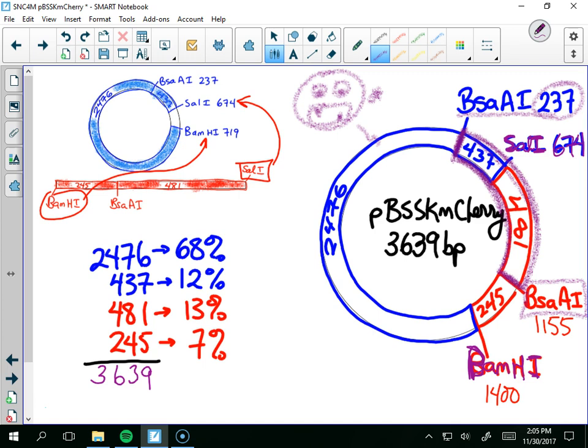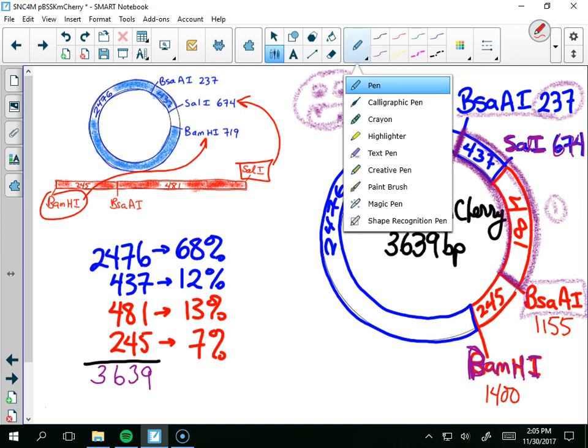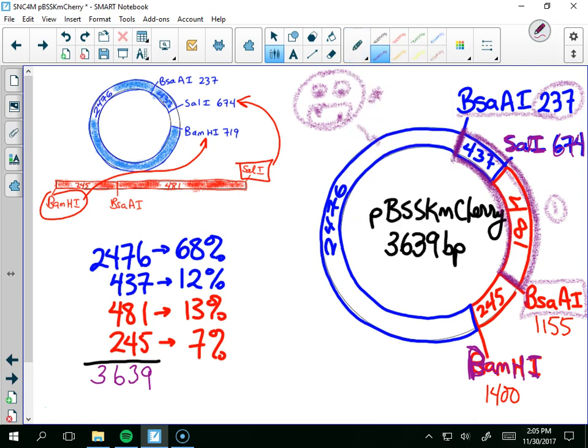That's how we prove that it worked. Because I'm going to generate that piece, which means that's the small fragment. Okay, we'll call it fragment 1. And I'll just use a different color so you can see it better. Oh, yellow, I guess.